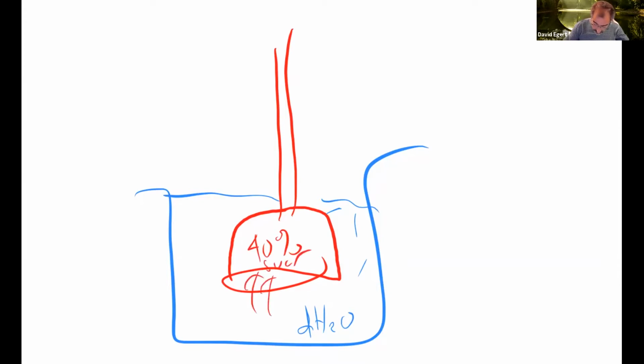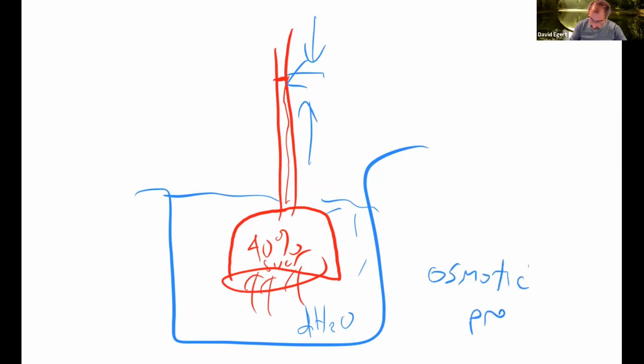The osmosis coming in, it's going up, it's going to hit some level where it finally balances the gravity pulling down and the osmotic pressure. In fact, when we talk about the word osmotic pressure, that pressure is how hard you have to push down to just balance and equal it out. So osmotic pressure, water's coming in by osmosis, hydrostatic head, the water pressure pushing down due to gravity.